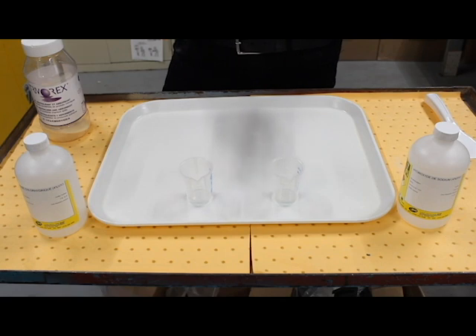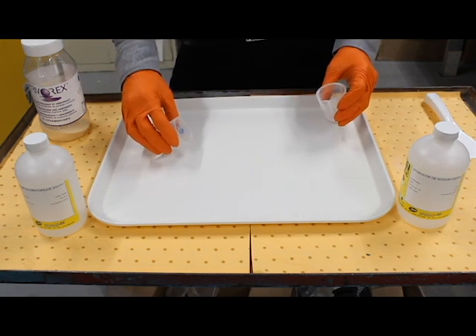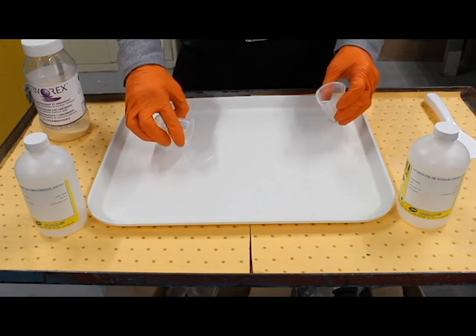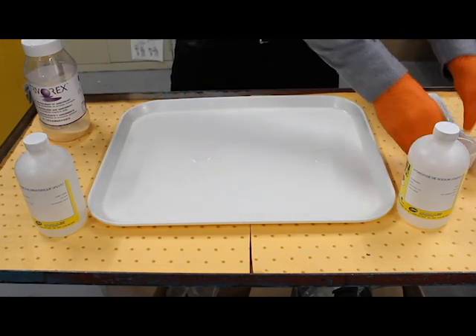At this point in time I really don't know which one is which, and that's one of the advantages of Trivorex — it will demonstrate to you which is which. So I'm going to pour out both chemicals onto this tray.